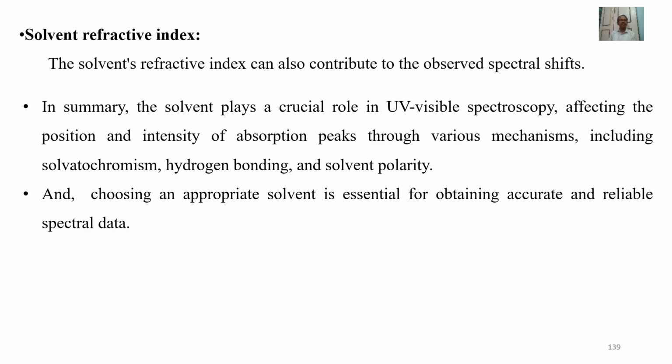In summary, the solvent plays a crucial role in UV-visible spectroscopy, affecting the position and intensity of absorption peaks through various mechanisms, including solvatochromism, hydrogen bonding, and solvent polarity. Choosing an appropriate solvent is essential for obtaining accurate and reliable spectral data.